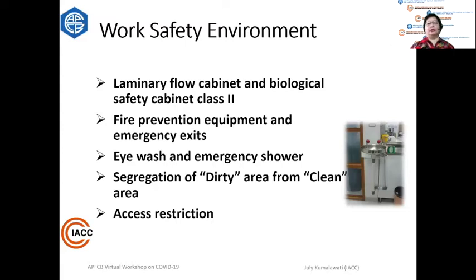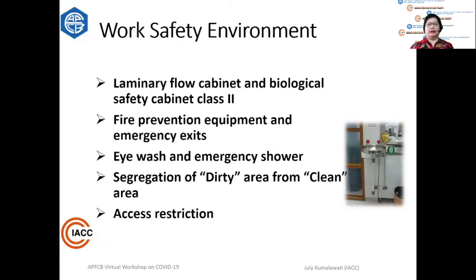Don't forget about the work safety environment. You need to install laminar flow cabinets and biological safety cabinets of at least class 2 — class 3 is also acceptable and better. Put in fire prevention equipment and emergency exits. Install eye wash and emergency showers if needed. You have to segregate the dirty area from the clean area, and make sure that access to the lab is restricted only to those working in it.